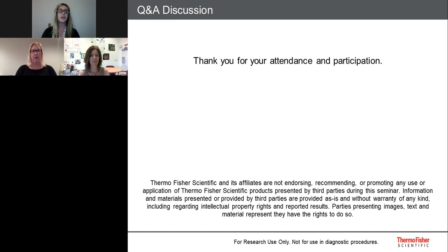Now, we are getting so many good questions today, but we do only have time for a couple more. So, Dr. DeLiu, why does the XON array have better exon coverage than your average whole exome sequencing data set? Well, I can basically only draw the conclusion based on the exome that we use, and that's the 50 MB exome enrichment.